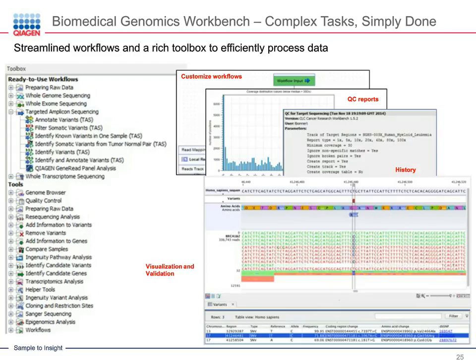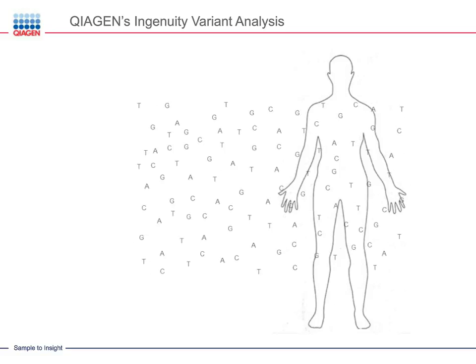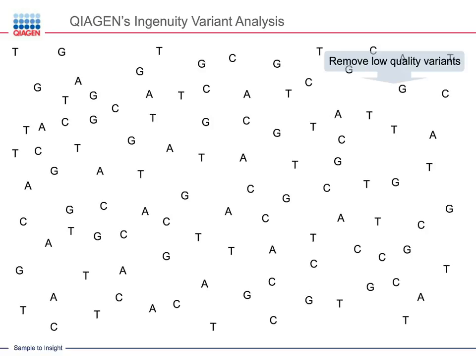Once you've generated the VCF file, which is the variant calling file, the variant calling file really identifies what are the mutations that are present in that individual. And if you imagine a typical individual who has around 4 to 5 million mutations, all these mutations are really a big data challenge. How do you understand which mutation is responsible for the disease or the phenotype that is observed in that patient? Well, variant analysis is a tool that allows you to just ask simple questions about the 4 or 5 million variants.